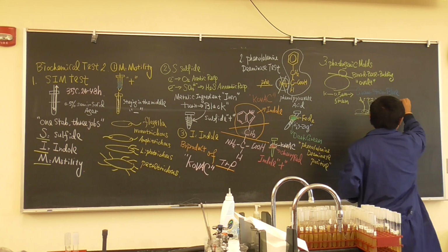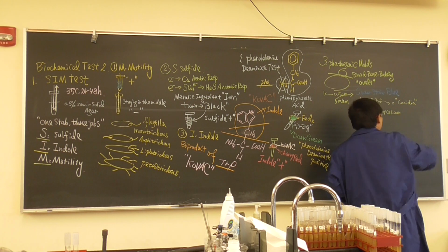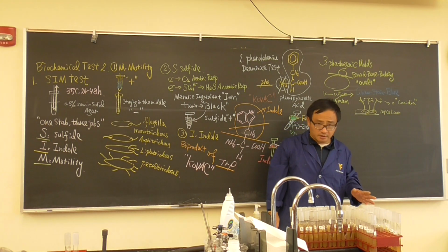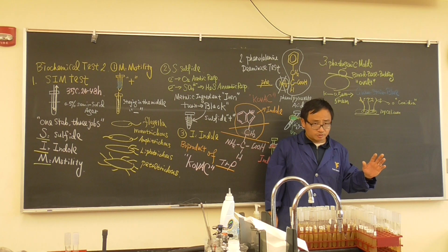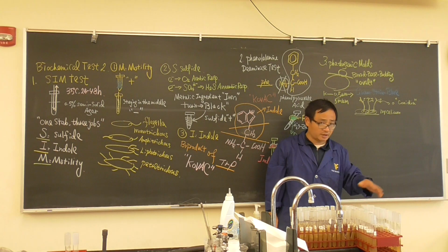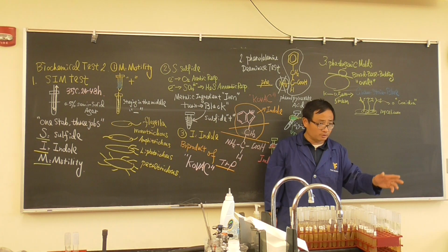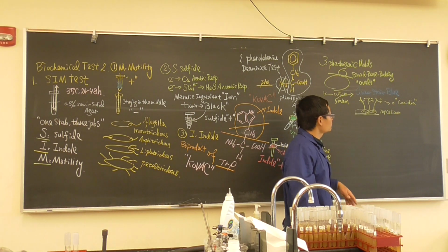This is called conidia. They will be released. In this area, in the Ohio River area, in Kentucky, West Virginia, Ohio, some pathogenic fungi are carried by bird droppings, called histoplasmosis. If you inhale, you're going to have some coughing, sneezing, something like allergy, but not really. It can cause lung disease. So I just want to let you know that.